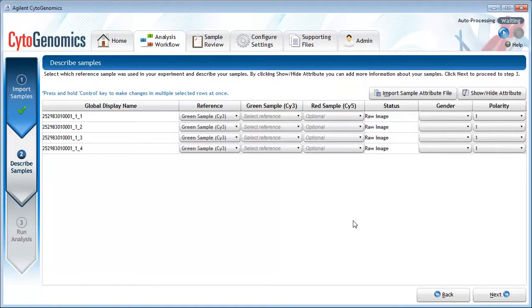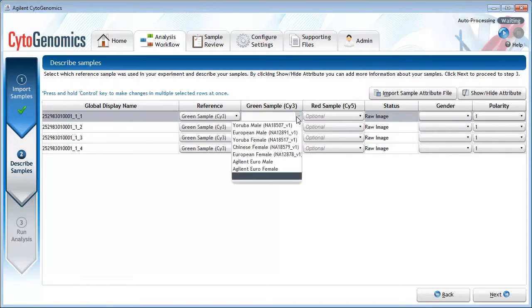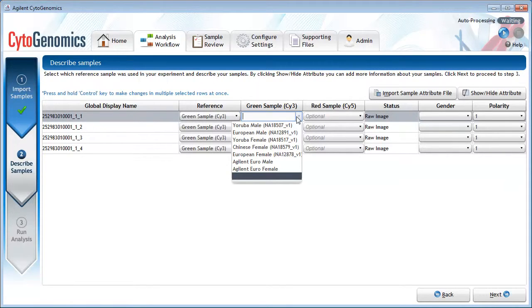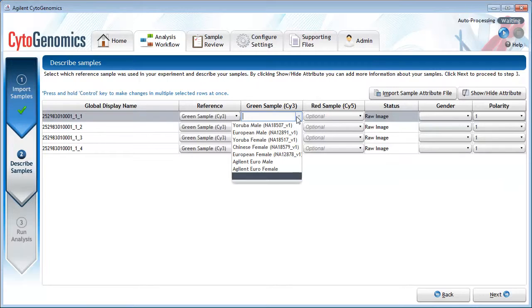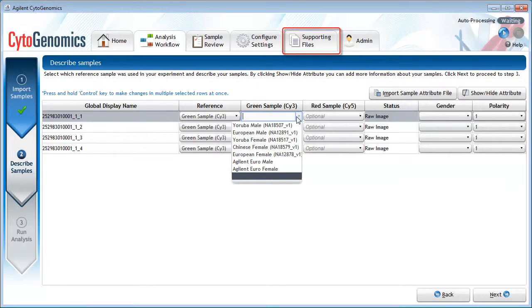For CGH SNP arrays, you need to select one of the options from the drop-down list. These options are the samples that have a genotype reference file in the database that describes the reference sample's SNP genotype. If the reference sample you used in your experiments is not in this list, you need to import a genotype reference file for that sample before you start your analysis workflow. You can do that from the Supporting Files screen.